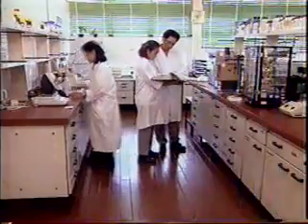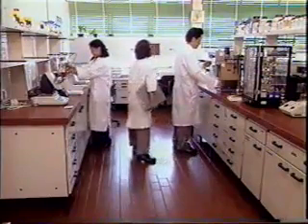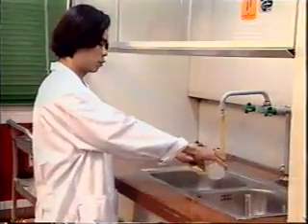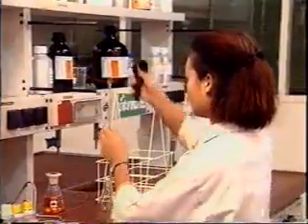Accidents. Most accidents occur because there is a breakdown in safe work procedures and administrative control. Glassware is sharp when broken. Chemicals can be corrosive or toxic. Even a wet floor can cause an accident. Even small accidents can lead to a major disaster. It is therefore important to report all accidents immediately. Cleaning up minor accidents immediately avoids any danger for a later accident.